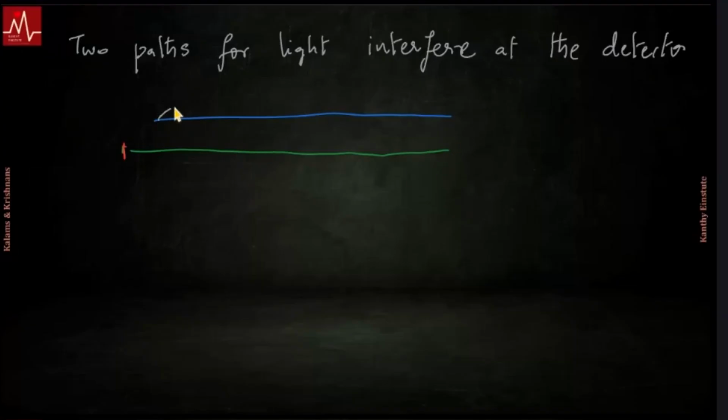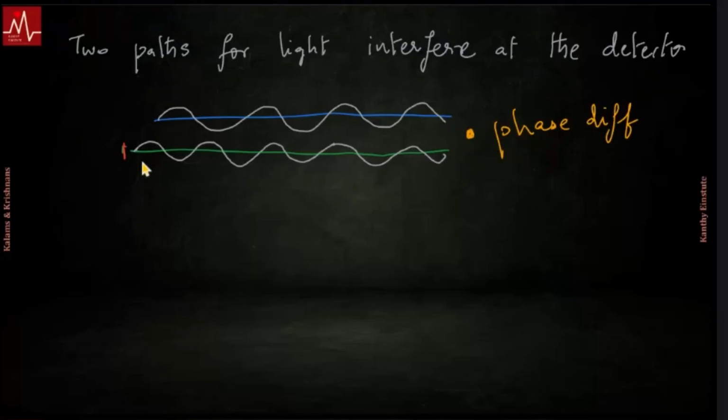If there is light of one frequency here, it shows up here, and there will be a slight phase difference. That phase difference depends on the extra distance the second path travels, the path length difference, delta. So your interfering wave depends on delta, okay? And notice these are slightly differing by two nearby locations, so these are spatially separated.